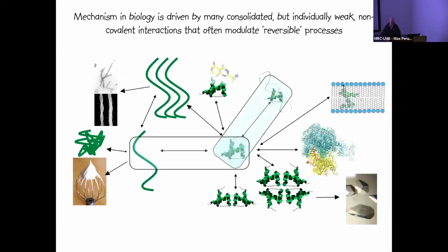So certainly in this building, this is the framework of what we're interested in. Obviously, we're not only looking at proteins, but in this context, we could think about proteins doing a whole variety of things that we're interested in: forming complexes, inserting into membranes, interacting with nucleic acids or ligands, and maybe multimerizing. There are probably still people doing crystallography, for example, but not so many. Cryo-EM would come in here for the big complexes.